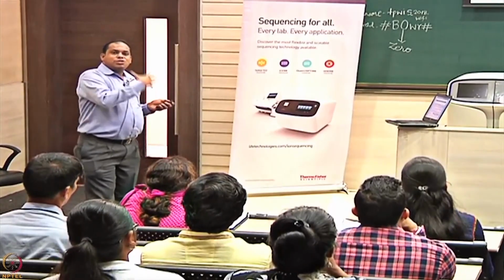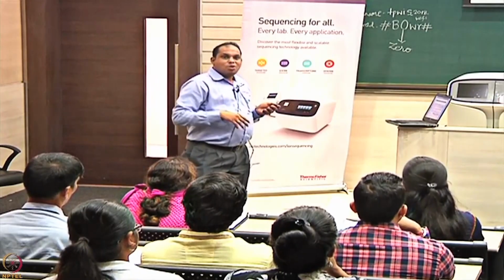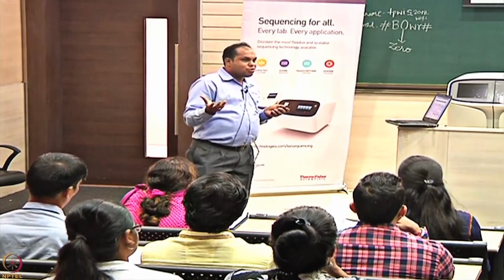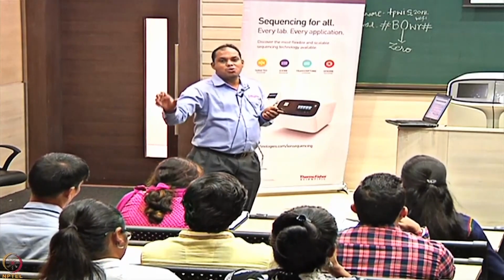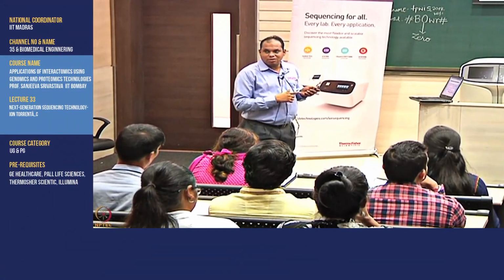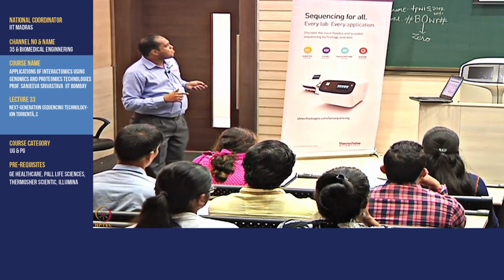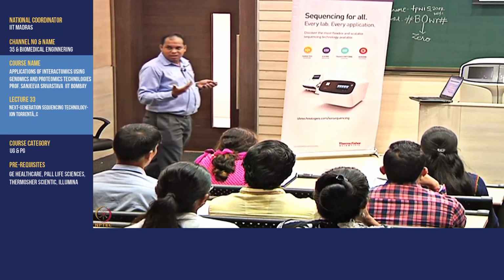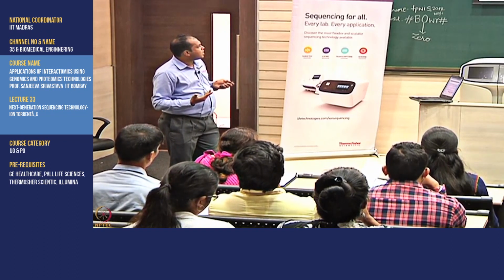So what happens? This tool helps you to differentiate between the DNA types, the type of data that you want to utilize for your studies, and what type of targeting you can do in such studies. Okay. So once this design is ready, you get to know how many amplicons there are and what type of sequencing I could do. The technology is defined based on my sequencing range also.